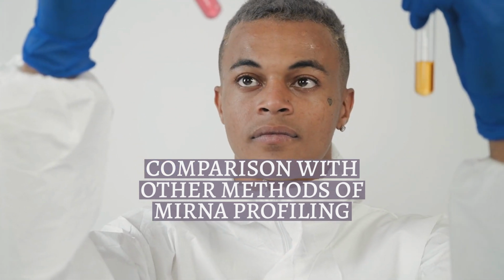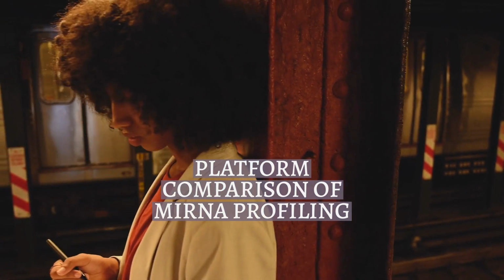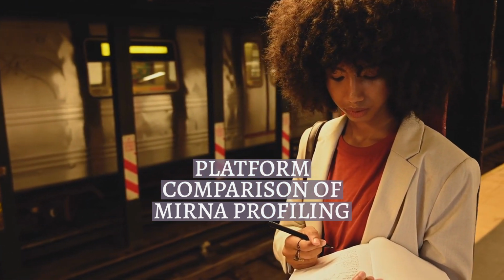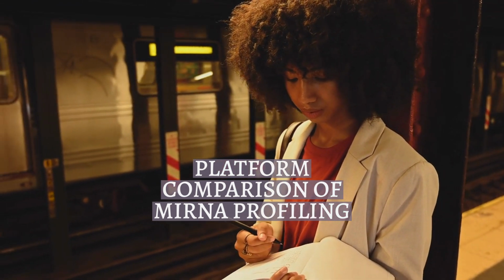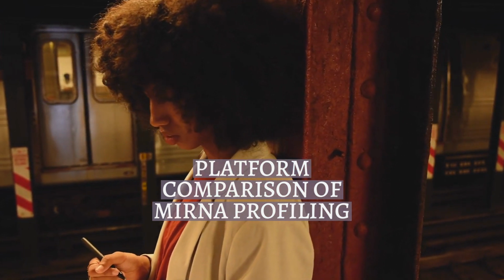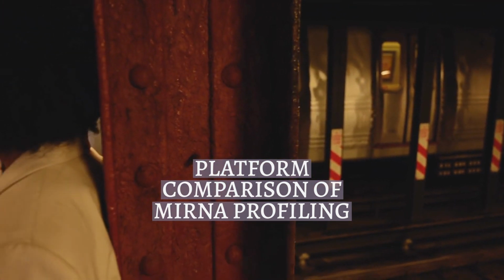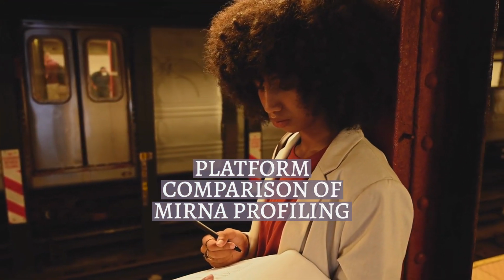Get ready for a captivating exploration as we unravel the layers of platform comparison of miRNA profiling and their profound significance. Throughput time: hours, days, weeks. Total RNA required: 500 ng, 100 to 1000 ng, 500 to 5000 ng. Dynamic range detected: 6 orders of magnitude, 4 orders of magnitude, 5 or more orders of magnitude. Infrastructure and technical requirements: few, moderate, substantial. Cost per sample: USD $400. Table 2, platform comparison of miRNA profiling.